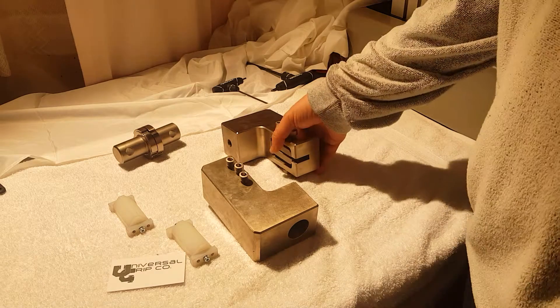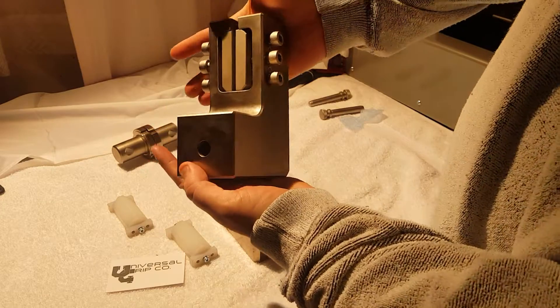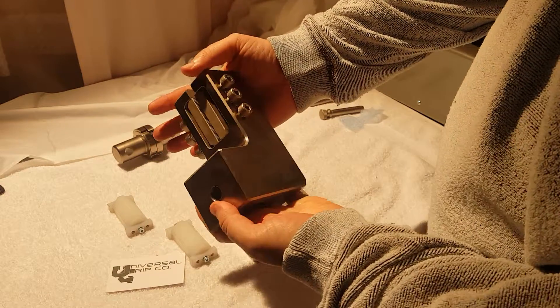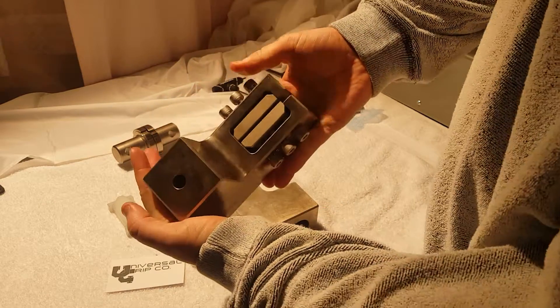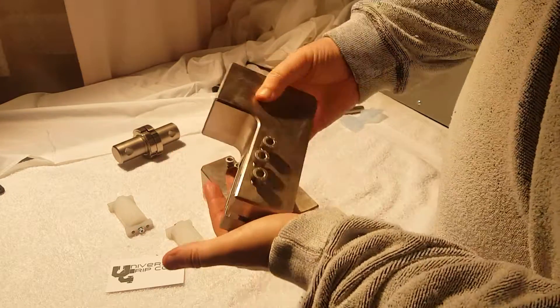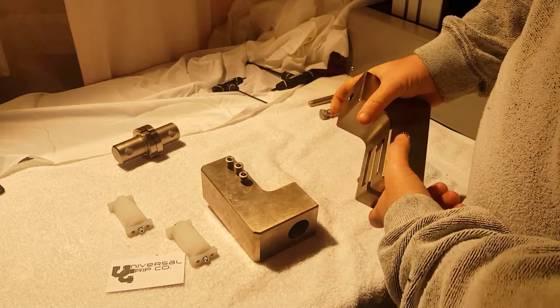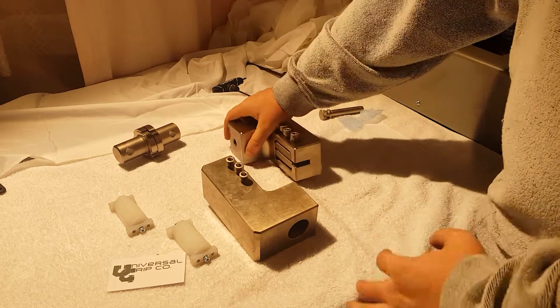Hello. Today we're going to show the ASTM D7078 rail shear fixture. This fixture is used to test composites in shear. It's used to test more flimsy or thinner composites rather than hard stiff samples.